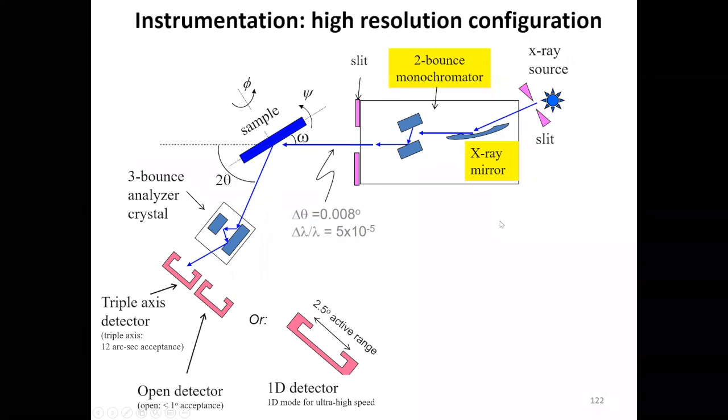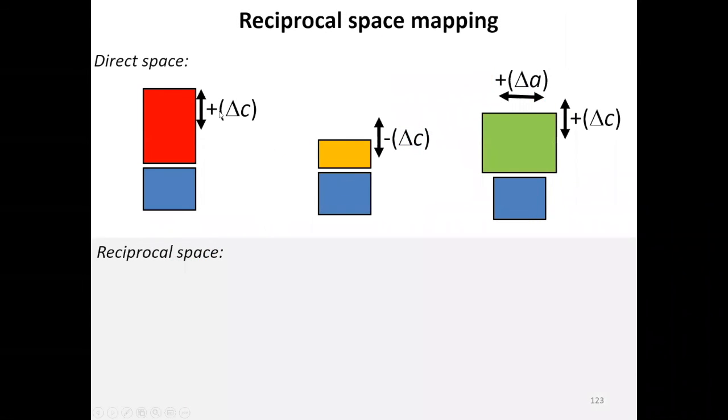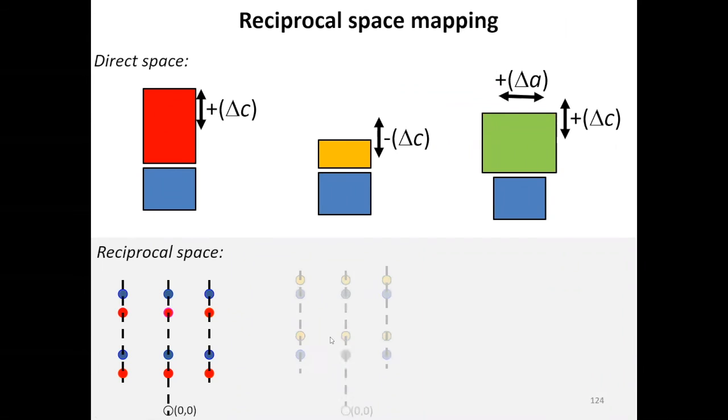The key here is that as you look at these structures in the reciprocal space, they have a different position relative to the substrate dots here. They may even have a different angular position there. You use this to your advantage, so that the same measurement that you did, the scan, becomes this one. This is the actual reciprocal space map. This is a two-dimensional distribution of this convoluted measurement you just did.